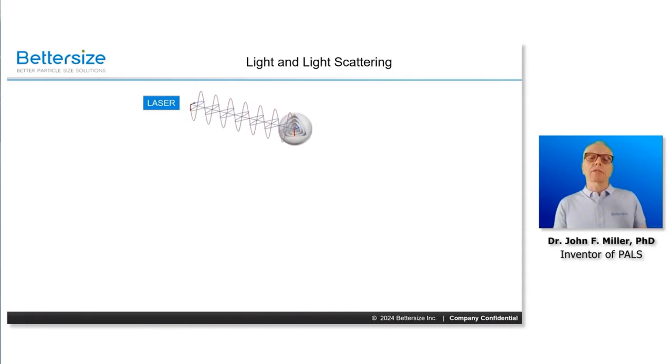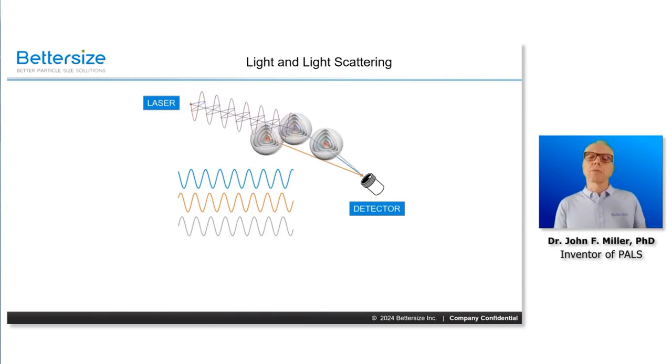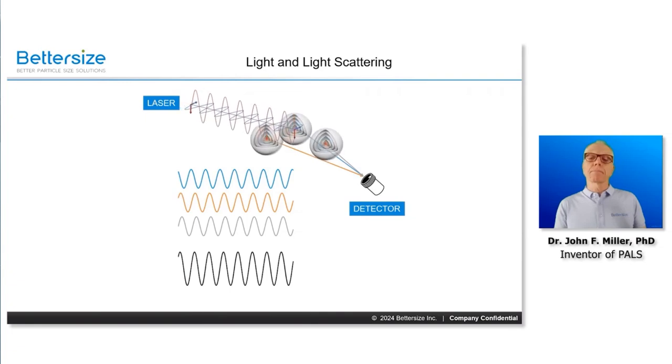In a light scattering experiment, a photodetector is placed to capture a narrow portion of the light scattered by electrons, such as those in nanoparticles. When you have multiple nanoparticles, each at different locations, the photodetector detects light from all these particles. The key to understanding the scattered light is the phase relationship between the waves emitted by each electron. By analyzing these relationships, we can extract information about the motion of the particles.